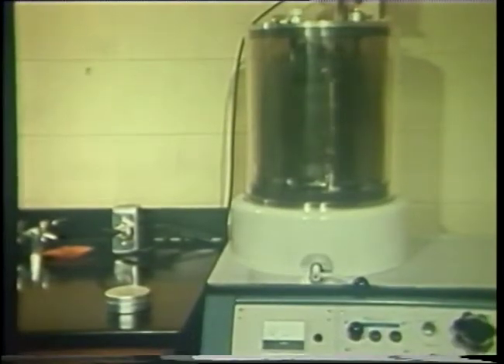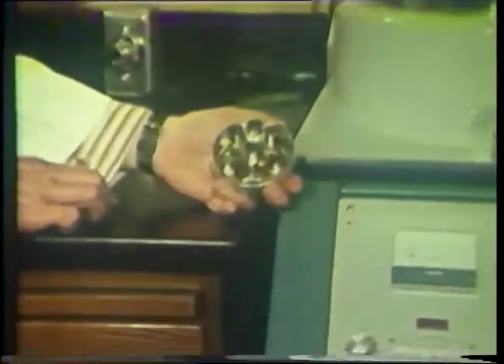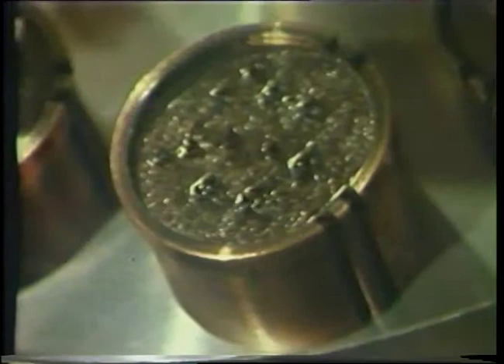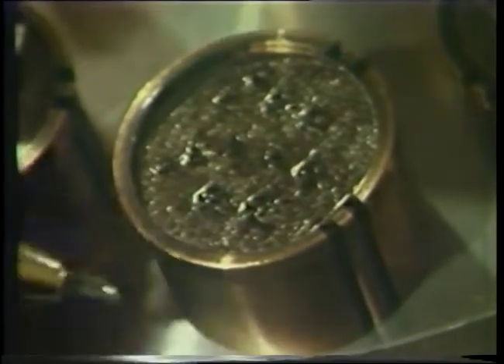This vacuum evaporator is used in specimen preparation. While even living insects may be studied with the scanning scope, better results are obtained when specimens are coated with a conductive material prior to examination. Specimens are placed in the bell jar, the machine is pumped down to a high vacuum, and a gold palladium alloy is condensed on their surfaces. Before this can be done, the material must be mounted on specimen stubs using duco cement, silver paint, or double-sided sticky tape.